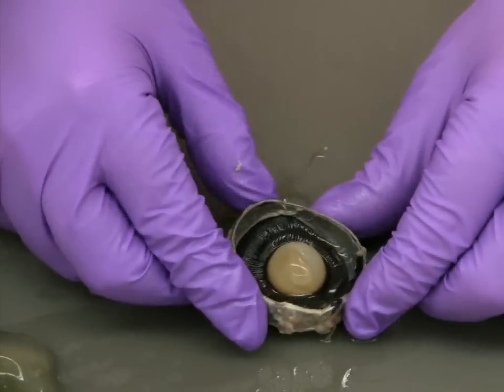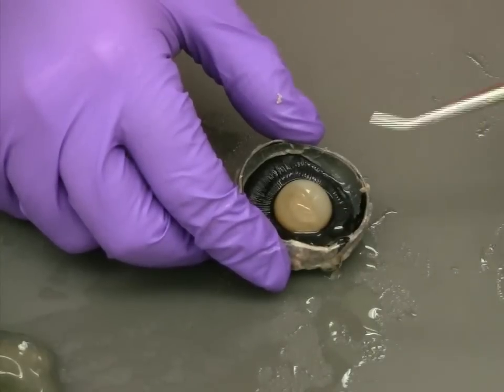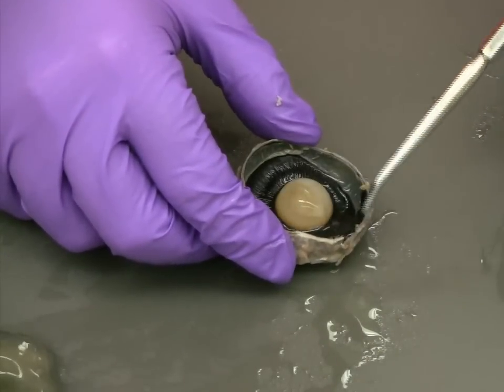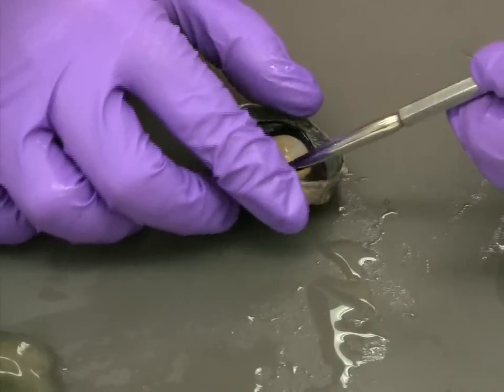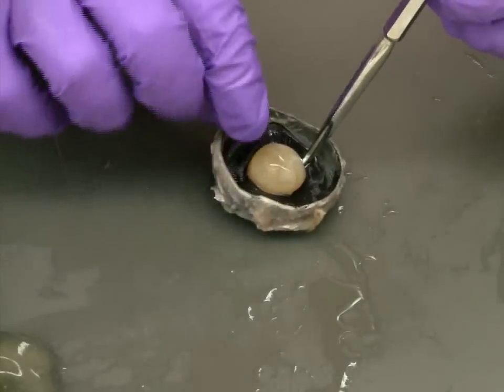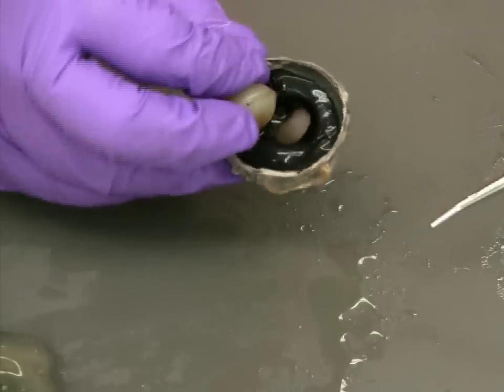Some portions of the vitreous humor may still remain in the eye, but at this point you should be able to clearly identify the lens and a dark ring surrounding it, which is the iris. Using your blunt probe, similar to how you removed the vitreous humor, you're going to want to loosen the lens from the body of the eye. It's held in place by a series of very small fibers, which may or may not be visible.